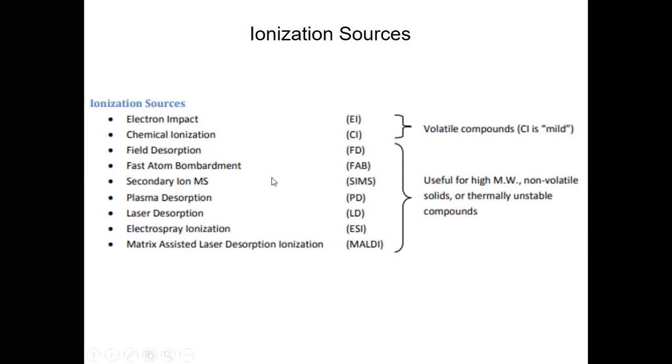Depending on the time that we have, let's see whether we can discuss all the ionization sources or only some selected ones. Anyway, I will discuss the ionization sources next week. Let's try to discuss all, but if not, let's discuss some important selected ionization sources. But keep in mind, these are the different types of ionization sources available.